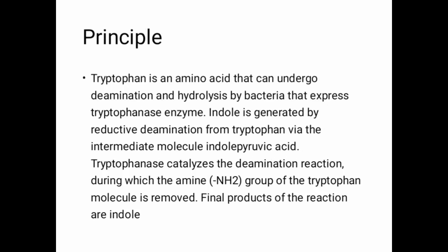So what is the basic principle of the indole test? Certain bacteria have the tryptophanase enzyme. Tryptophanase is the enzyme that breaks down the tryptophan in the culture medium, and the end product is indole. We detect this indole by certain methods.